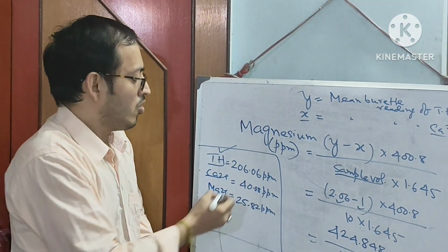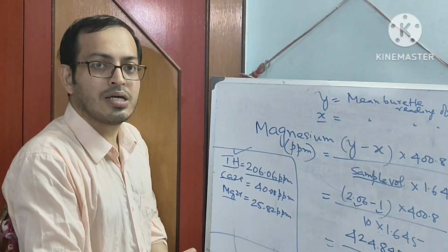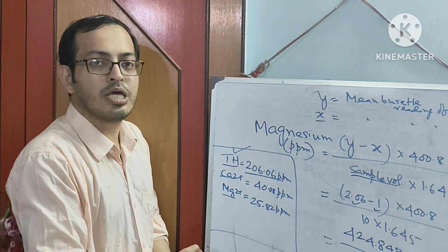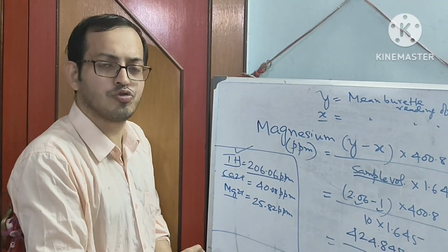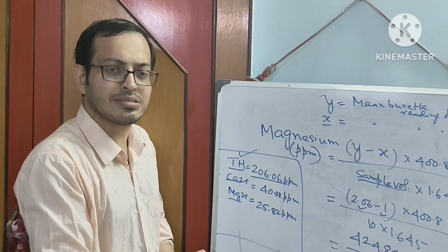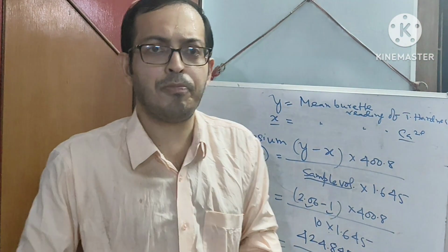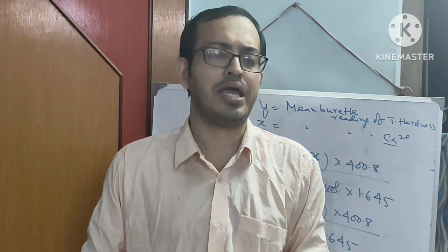Okay, so this sample water is hazardous for human health, and it is not very much suitable for any pisciculture practices. So I hope this video will help you to estimate the amount of total hardness, calcium and magnesium from any sample water.